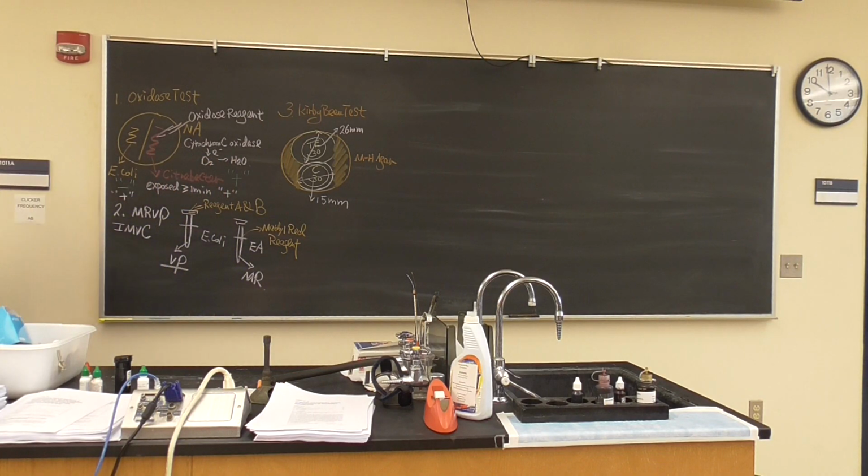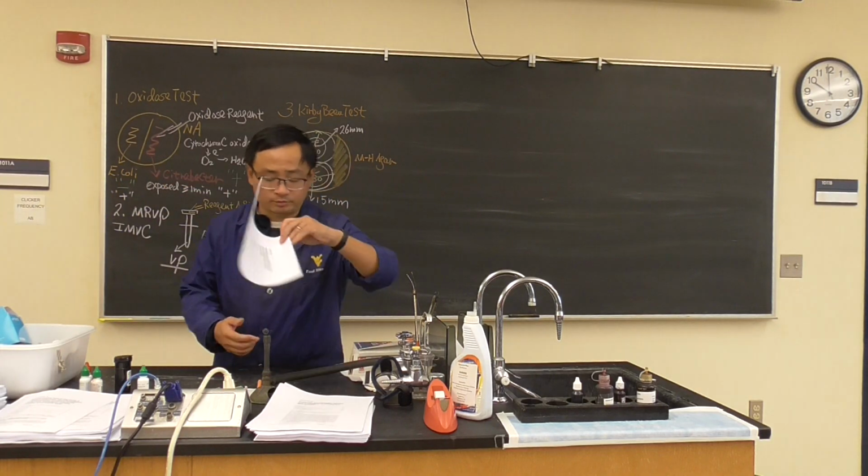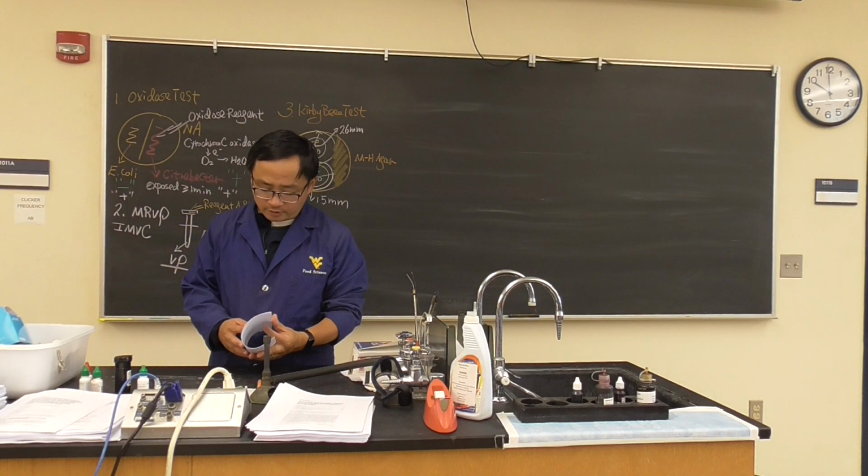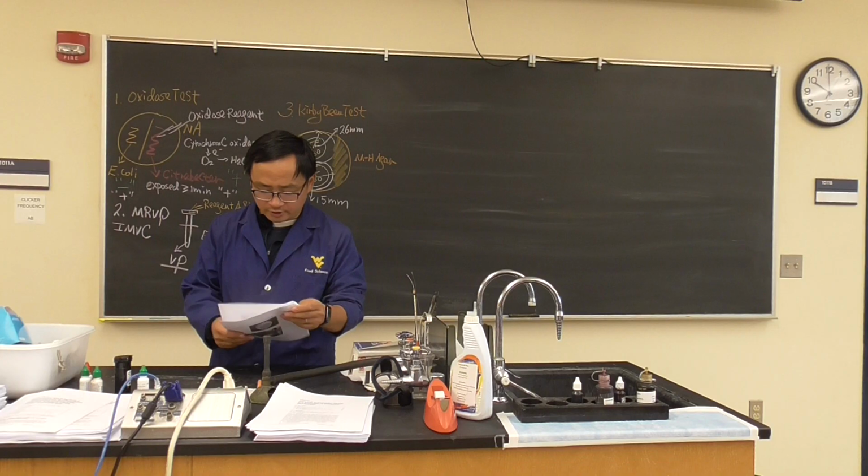Okay, now what we're going to do? I'm just doing a demo. You can do it by yourself. We're going to compare with the table. That's why it is important. So look at the table at page 135.